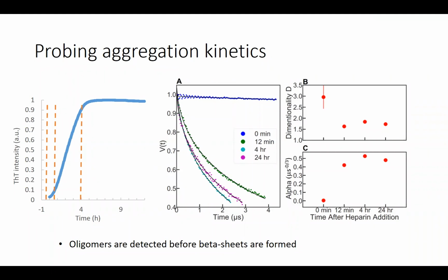Sorry. Can I? Yeah. So we have seen in some cases that the relaxation time can give you some indication, just by looking at the slope of the decay, about differing rates in the relaxation time.